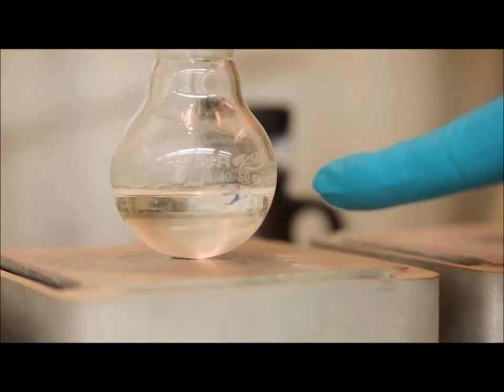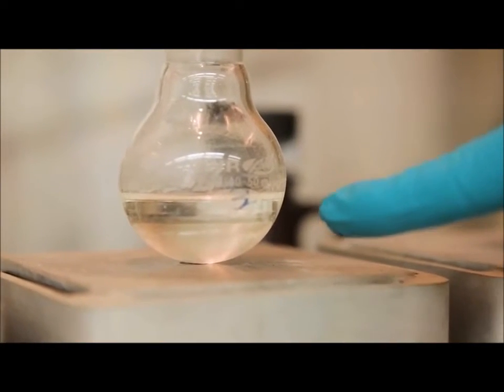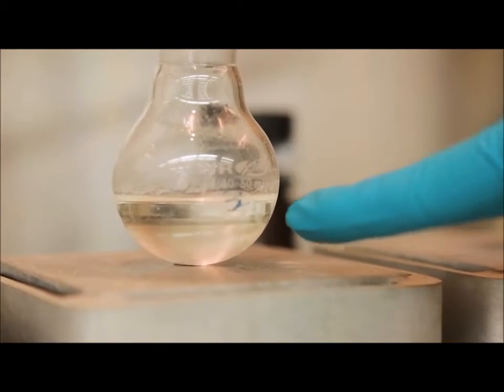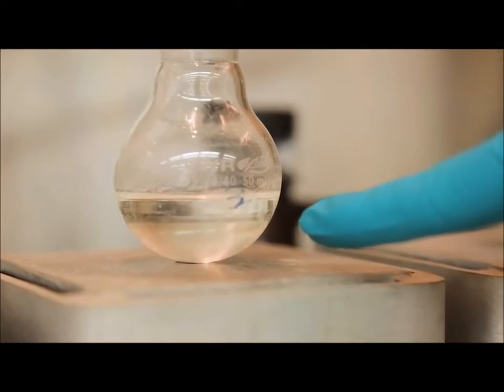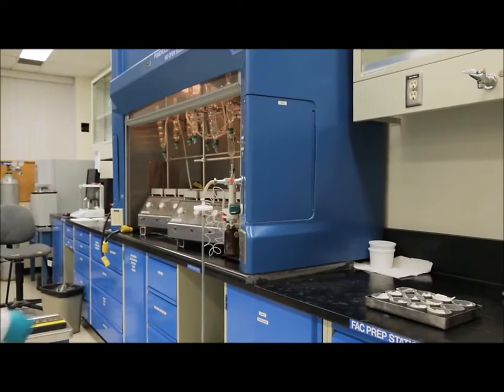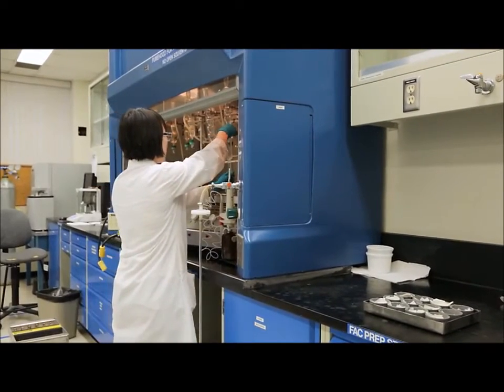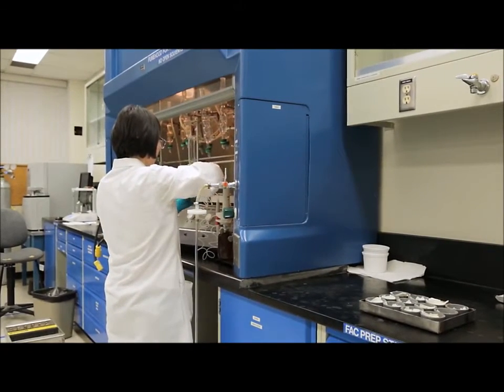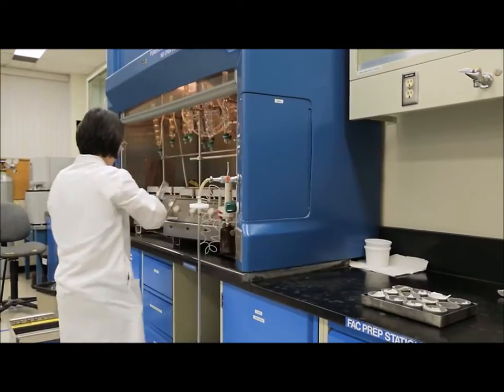Once the sample is cooled, you will see that the heptane layer has separated out to the top. It is the heptane layer that will contain the extracted fatty acid methyl esters. We can now remove the boiling flask from the apparatus.